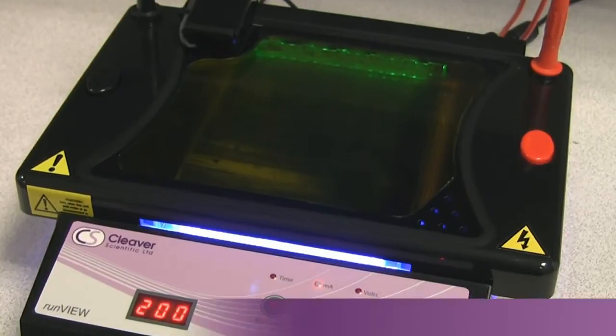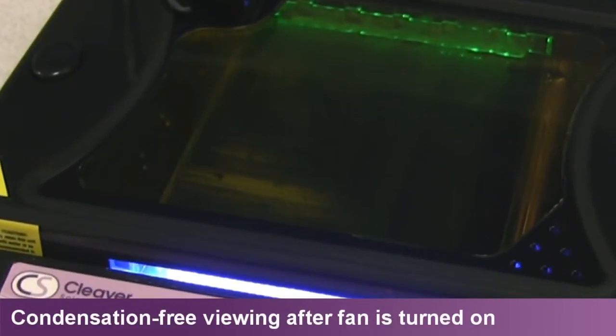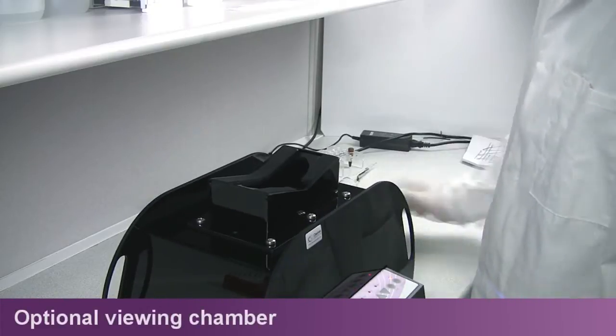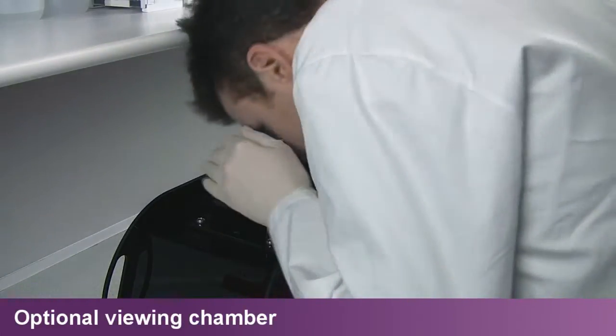An extractor fan powered by the base unit ensures condensation-free visualisation of sample migration, while an optional viewing chamber eliminates background light to enhance visualisation of faint, low-concentration samples.